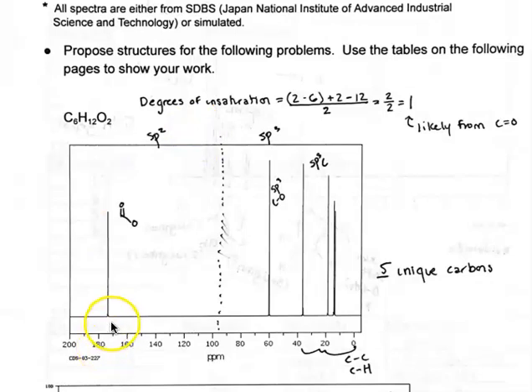So this peak right here is an sp2 hybridized carbon, which is double bonded to an oxygen and single bonded to another oxygen, and that is in agreement with the idea that we have an ester as a functional group in this molecule. It also reinforces the idea that those oxygens are going to be connected to the same carbon in this molecule.